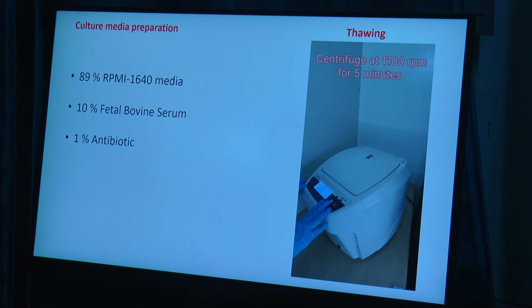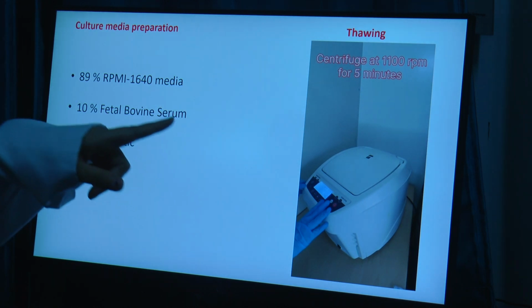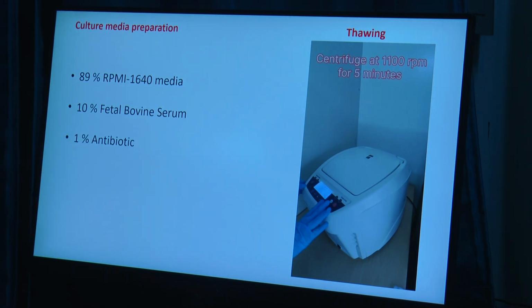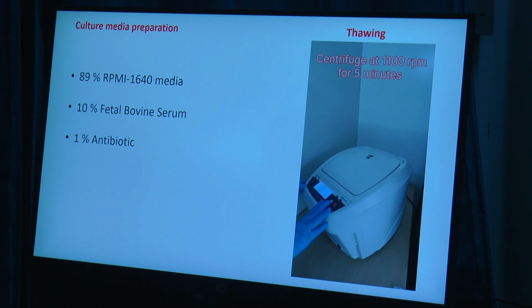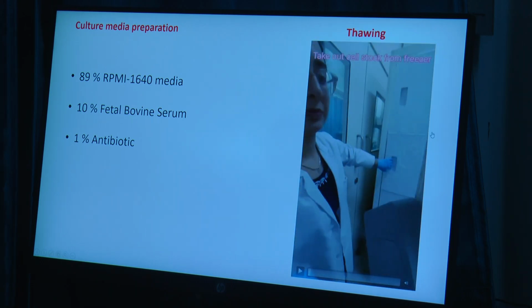Got it. So, after diluting it with the cell culture media, with this composition, we centrifuge them, because right now the cells are in the liquid phase, so we need to separate them from the DMSO. For that we centrifuge, and then we form a cell pellet inside that. So that will be like the precipitate.